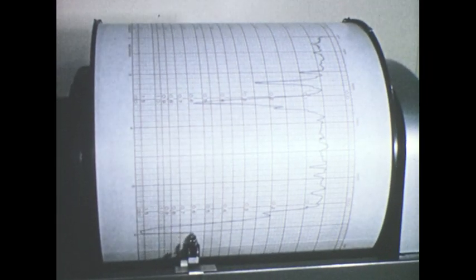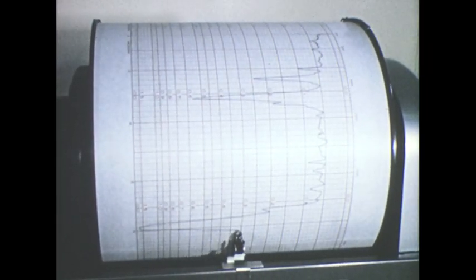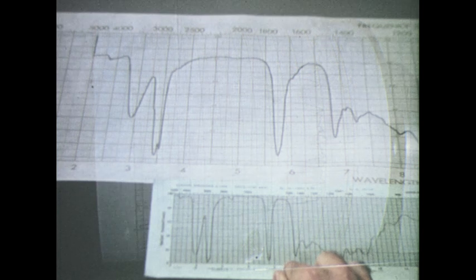Looking at an infrared source, a ceramic rod glowing at a temperature of 1200 degrees absolute. Your eye can see the visible wavelengths produced by this source, but cannot see the invisible rays of infrared radiation. This infrared radiation, which feels only moderately warm to your hand, provides the scientist with one of his most powerful analytical tools. The absorption of this radiation and its subsequent analysis produces an infrared spectrum, a fingerprint, just as characteristic of a chemical compound as a human fingerprint is of an individual.